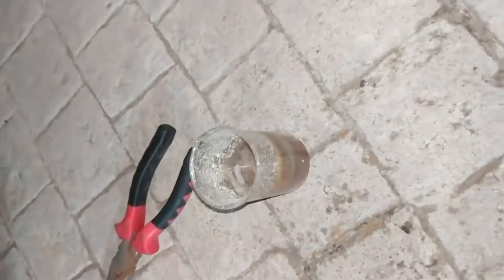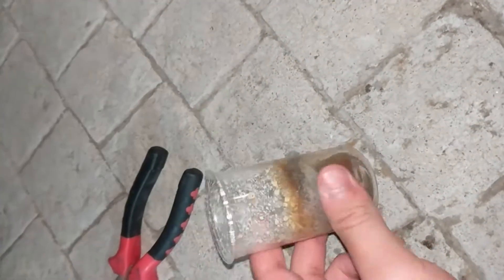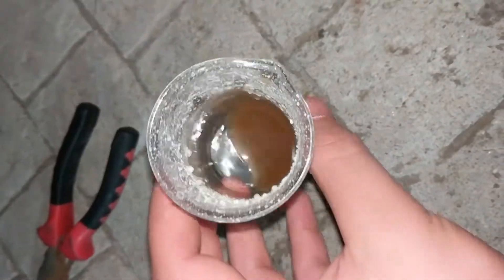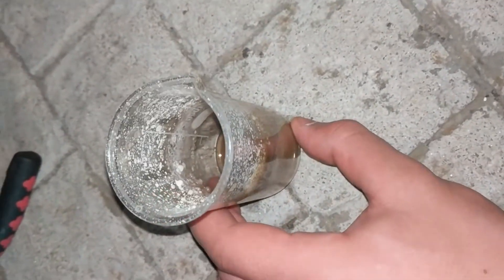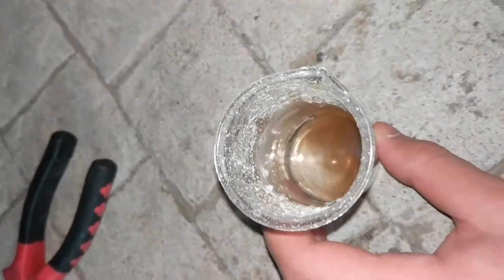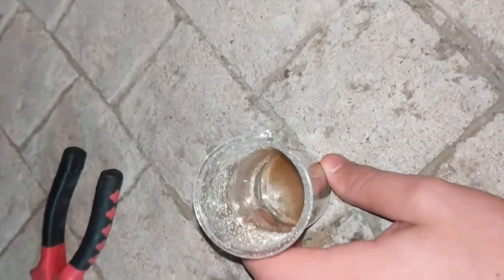I was trying to make some silver nitrate by the traditional method of mixing silver with nitric acid and then boiling it down, but as you can see I screwed up. It's turned this brown color. What happened is I boiled it down from 60 milliliters and it got to this point where it was kind of solidish, and then it started going a bit dark on the edges.